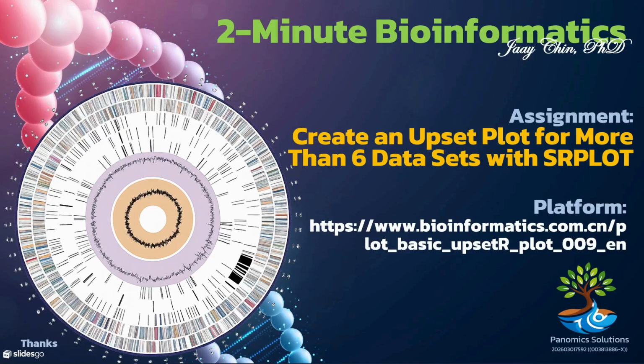In today's short tutorial, we're going to show you how to create an upset plot for more than 6 datasets using SRPLOT. If you're working with multiple gene lists, microbial communities, or any complex biological data, an upset plot is a powerful alternative to traditional Venn diagrams, making it much easier to visualize shared and unique intersections across many datasets. So, let's get started and learn how to generate a clear, publication-quality upset plot with SRPLOT in just a few simple steps.